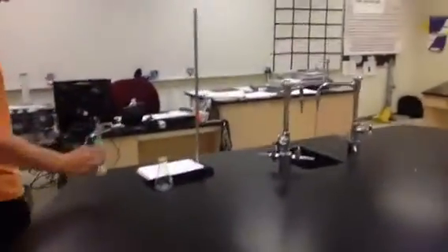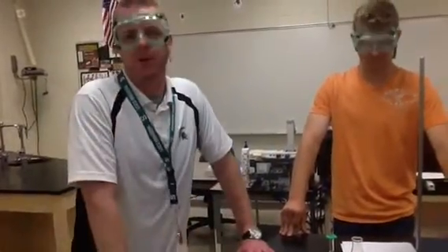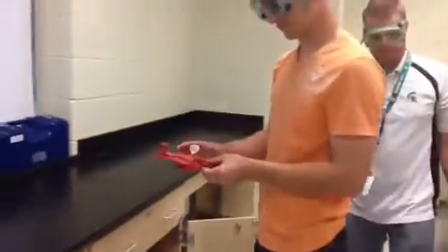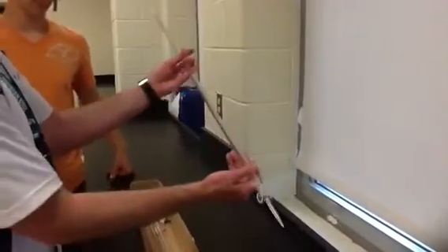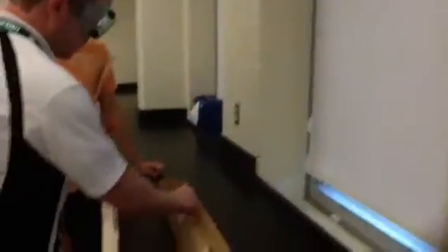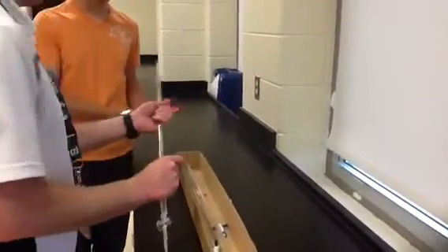Now is the most important part. Jacob Fielder is going to obtain the things he needs to actually do the titration — a burette and a burette clamp. The last time I bought burettes they ran somewhere around $125 to $150 each, and the tips are pretty sensitive. You break it, you buy it. Back here in this drawer you'll find burette clamps. He'll grab one, then get a burette. We remove the stopcocks from them every single time to keep them safe. This burette is lettered D, and it corresponds to a stopcock also lettered D. He grabs the stopcock, the appropriate burette, and his clamps, and we head to our workstation.